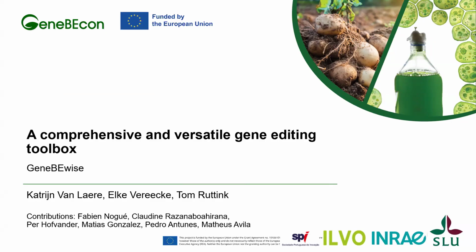So I will tell you today about the comprehensive and versatile gene editing toolbox. We call it GeneBWise, which was developed during the GeneBEcon project. Actually, it's a collaboration between my institute, the Flanders Research Institute of Agriculture, Fisheries and Food, but also with a lot of contributions of SPI, who developed the website, and also INRAE and the Swedish University that all produced protocols that were added to the toolbox. So it was a very efficient collaboration.